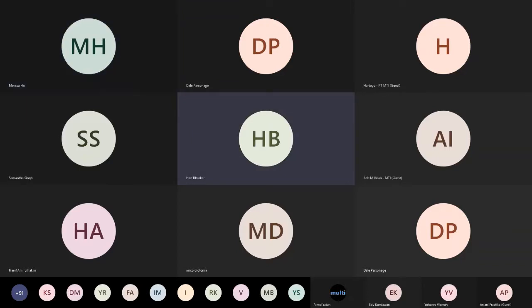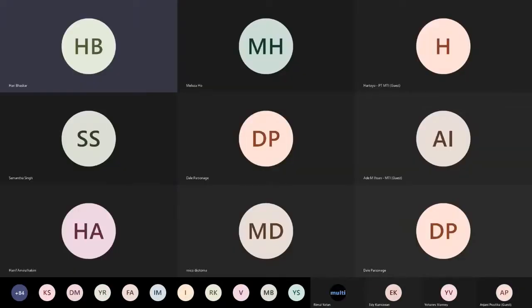Okay, we can measure carbon on the Epsilon 4. We have a special version of the Epsilon 4 with a special detector. It's called the ultra detector, which can measure carbon. So the standard Epsilon 4 starts from fluorine, but if you really want to measure carbon, then there's a special detector, and you need to buy that version of the Epsilon 4, which is sensitive to measure carbon.